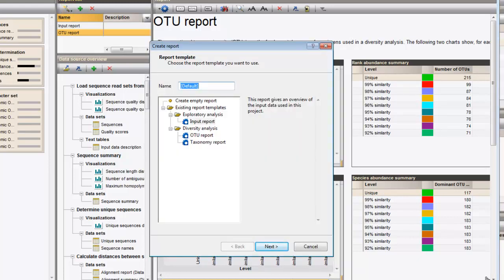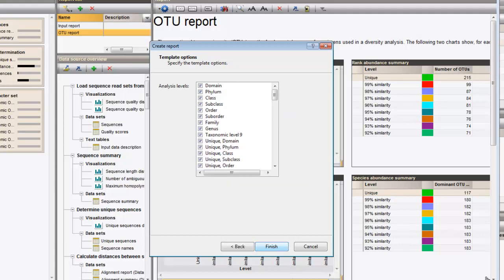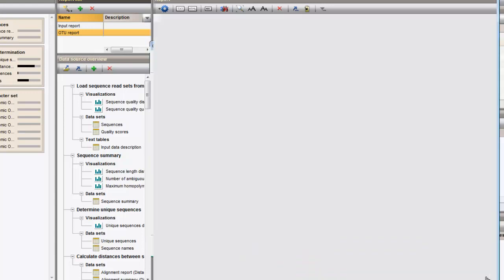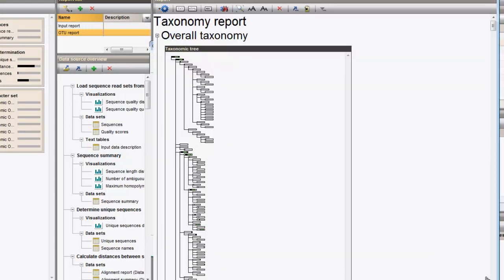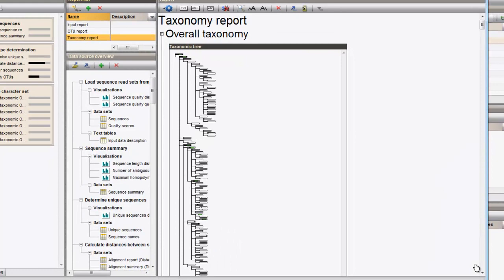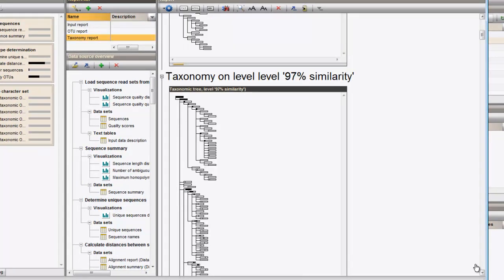The last and probably most interesting report for this analysis is the Taxonomy report, which will give us an overview of the taxonomic information present in the sequence read set. In this example, I will only display the Taxonomic Identification results for our similarity cutoff at 97 percent. The Taxonomy obtained for the complete read set is displayed on top and just beneath the Taxonomy on the 97 percent similarity level.